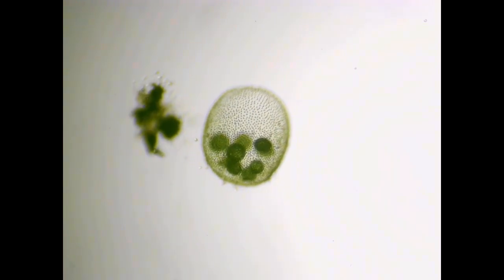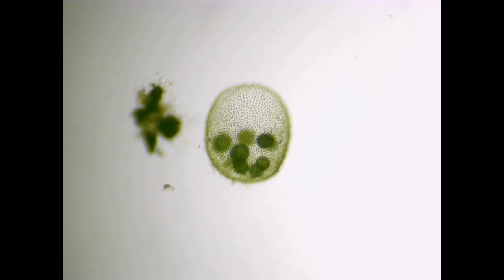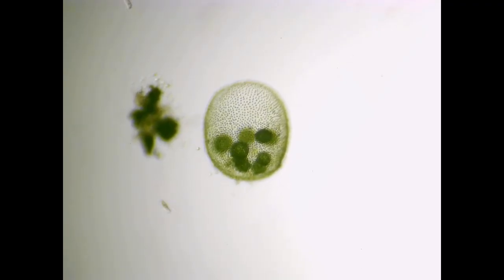Most cells are somatic, non-reproductive. A few large cells are gonidia, reproductive. Gonidia divide to form daughter colonies inside the parent. Eventually, the parent colony ruptures to release the daughters.